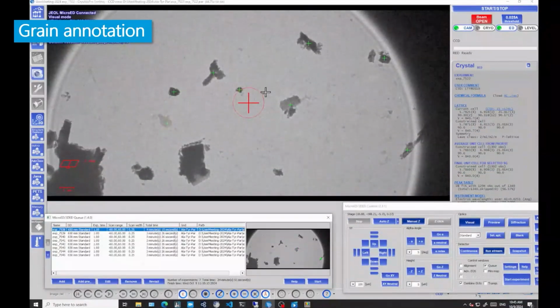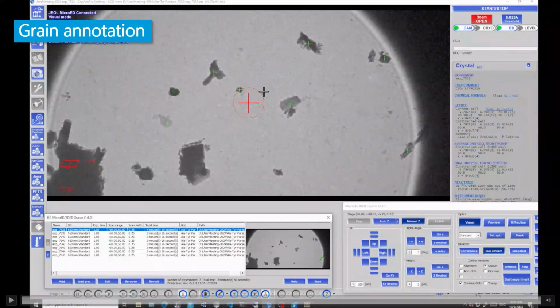I should say that at the moment, this is a major topic to improve this mechanism with machine learning approaches. I would say this is obvious that this is something that machine learning should be used for. So I think, for example, that most experienced practitioners of ED wouldn't have selected this. They would have actually selected this, maybe not this.